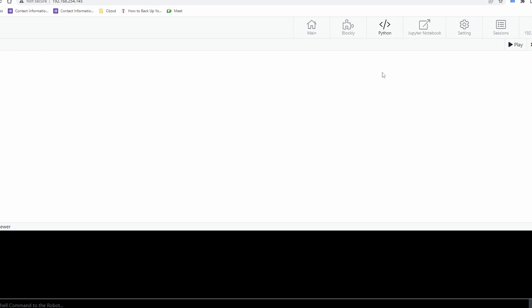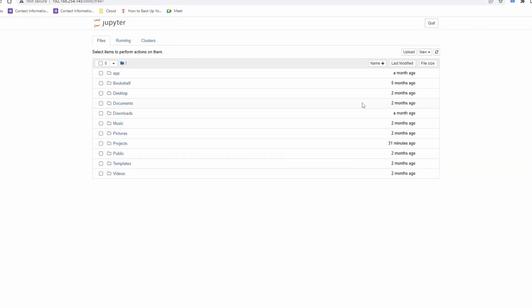Python is already installed on the Donalab controller and you can directly write your code and execute it on the controller. Donalab provides two ways of writing and running your Python codes. You can either use the Python tab in Donalab or use the Jupyter Notebook tab to access Python. We will use Jupyter Notebook in this example.